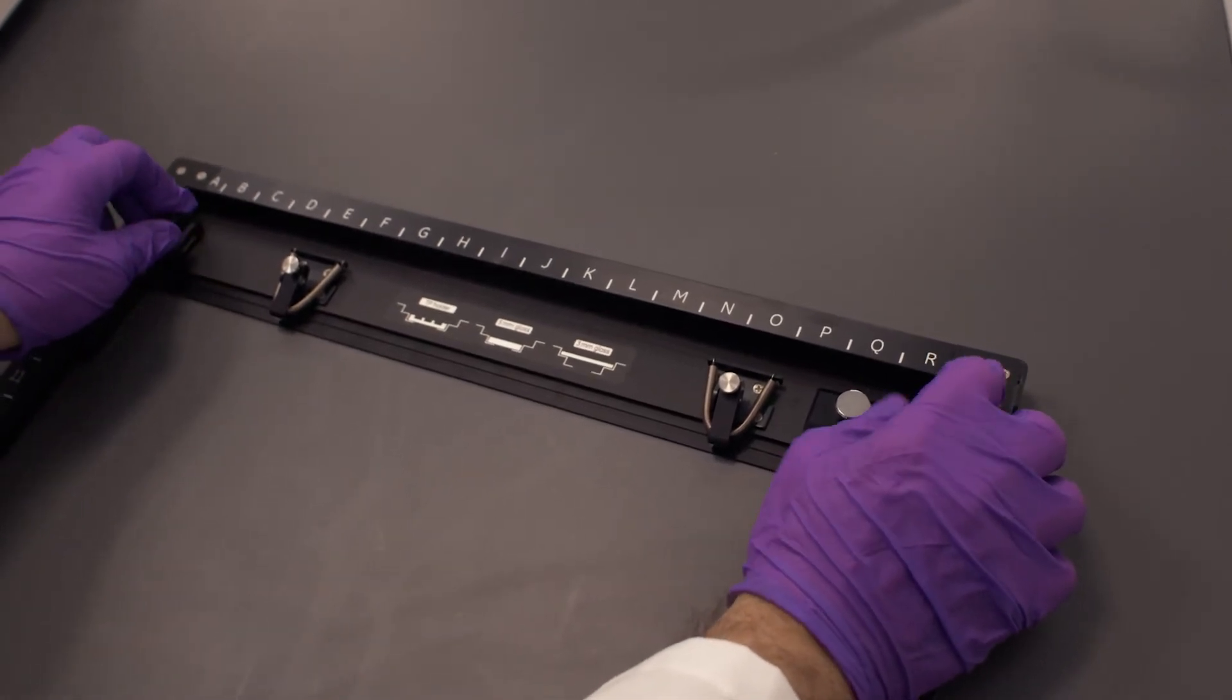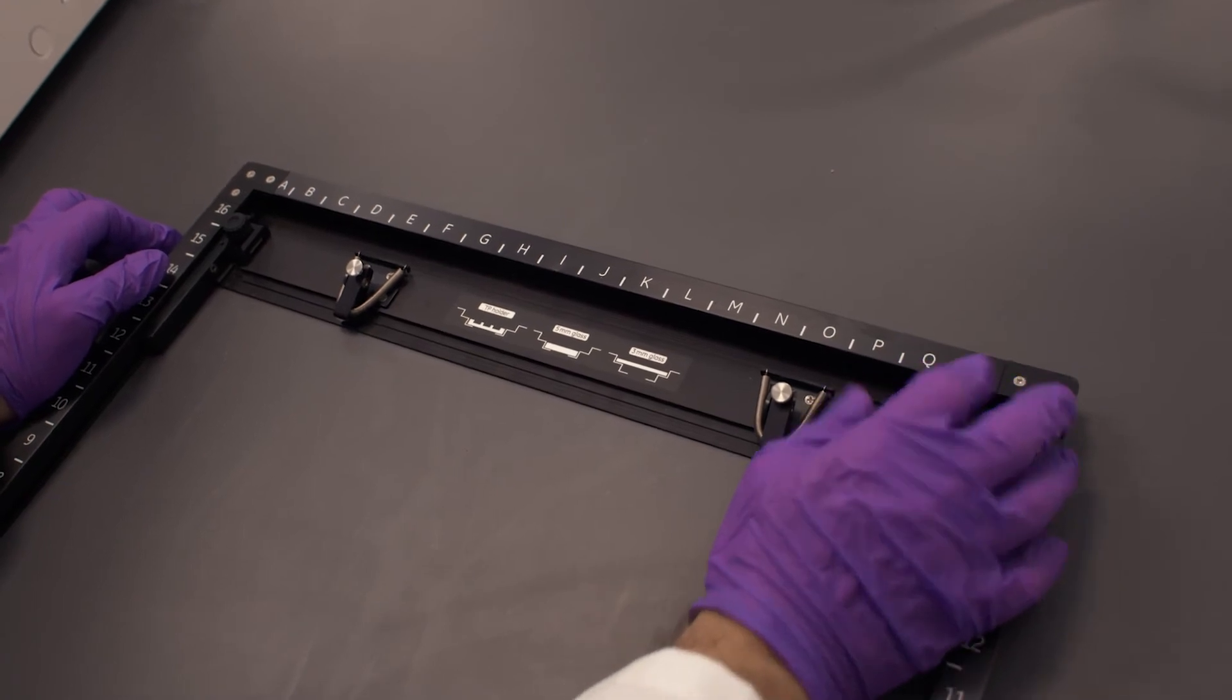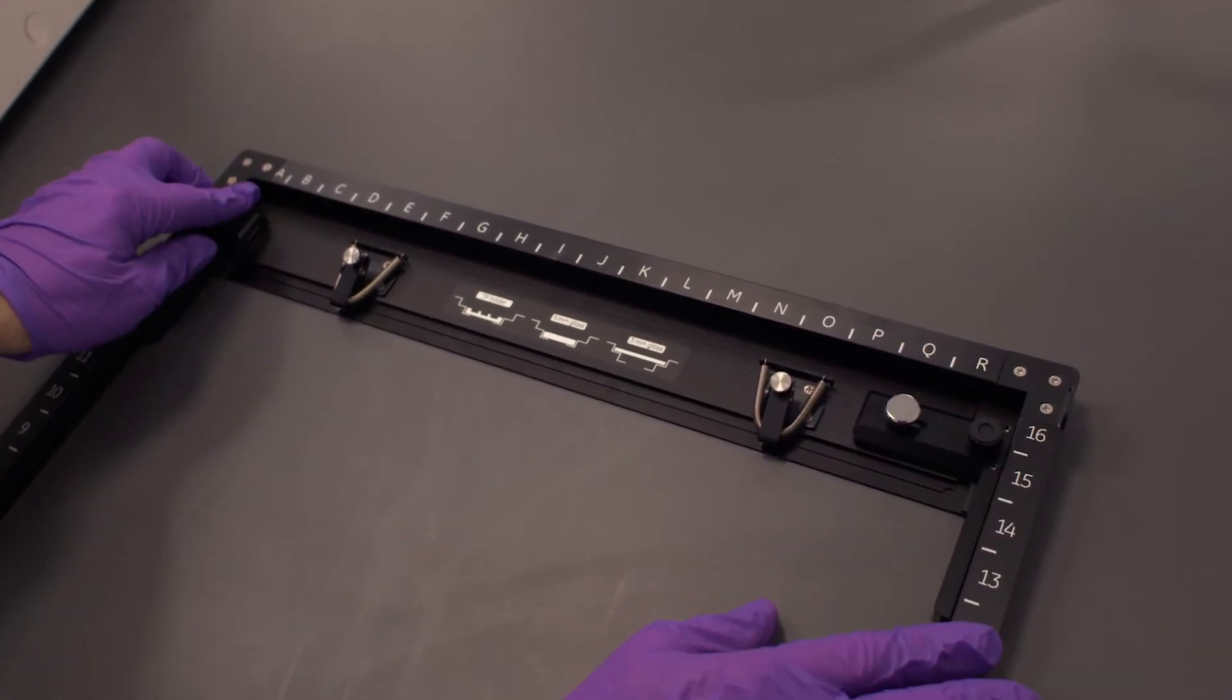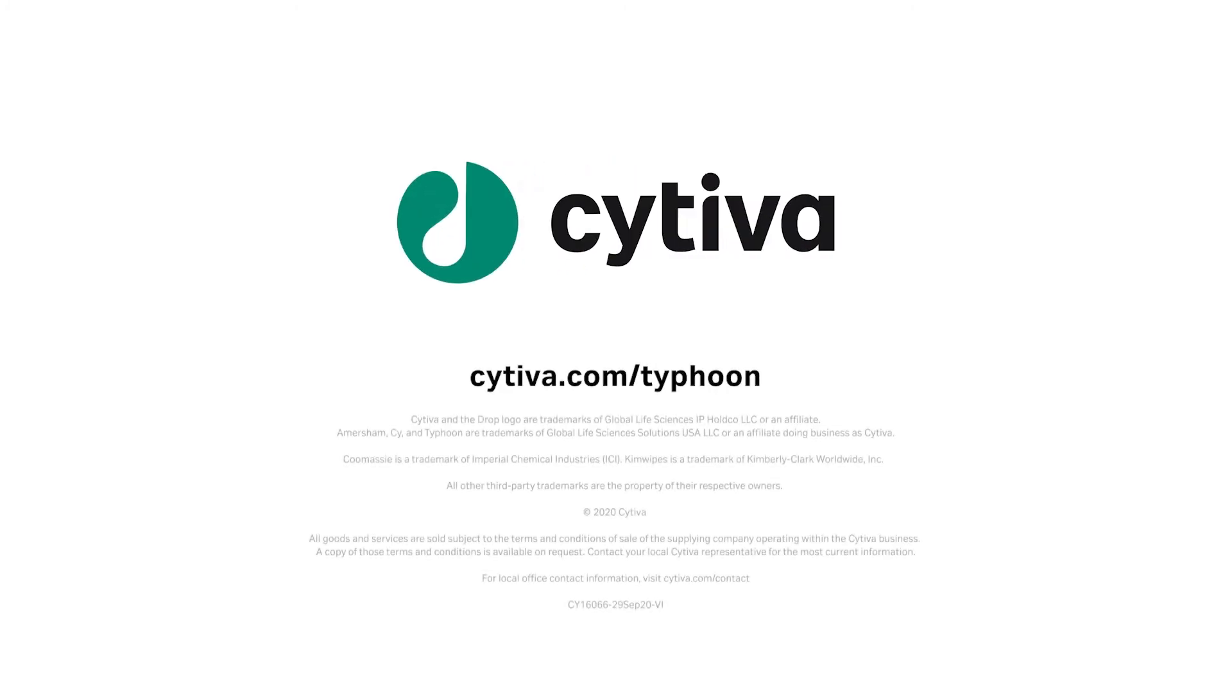We're going to tighten the outer screw there, and then we're going to do the silver screw last to make sure that's locked in place. Make sure the screw on the left-hand side is done as well. And now we have our multi-stage ready for our regular use.